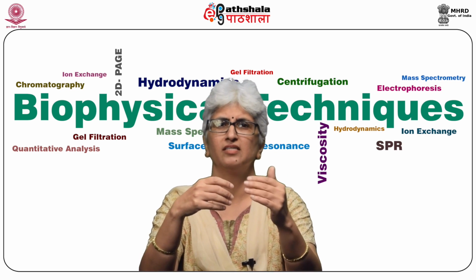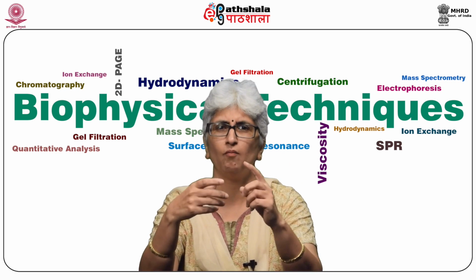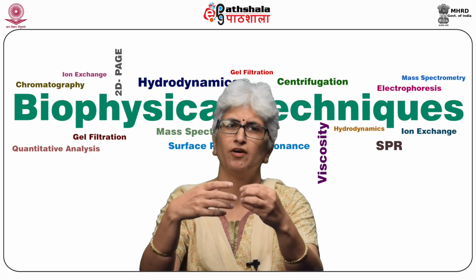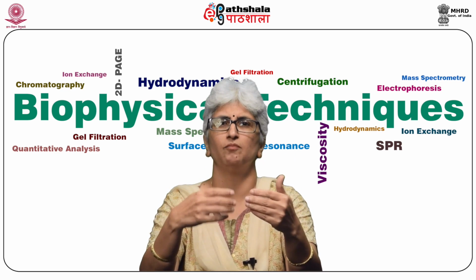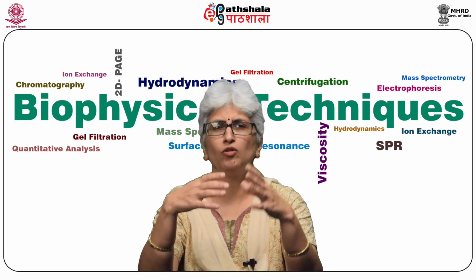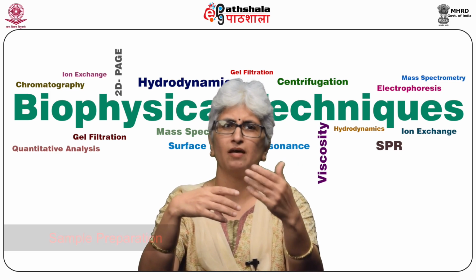Another important factor is the buffer system, the buffer which you are going to use. The buffer should be such that both the molecules, your ligand as well as the target molecule, are stable in this buffer. And it should not affect the interaction between ligand and target molecule. So, the interaction between ligand and target molecule should be maintained, and both the ligand as well as your target molecule should be stable.